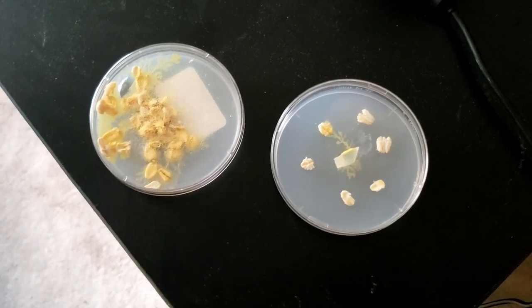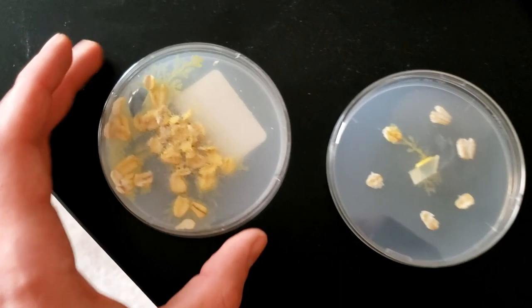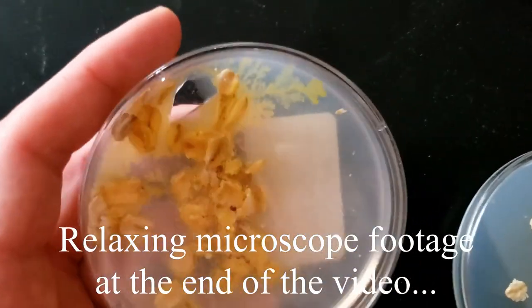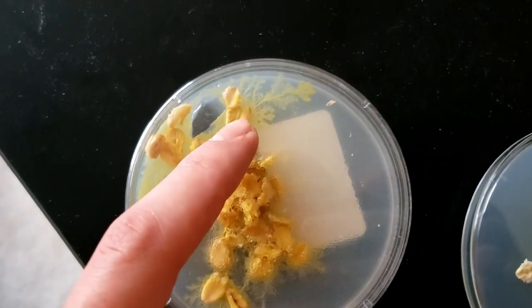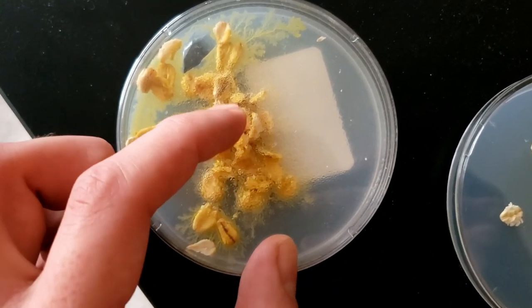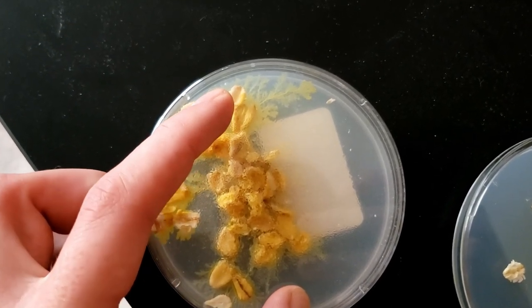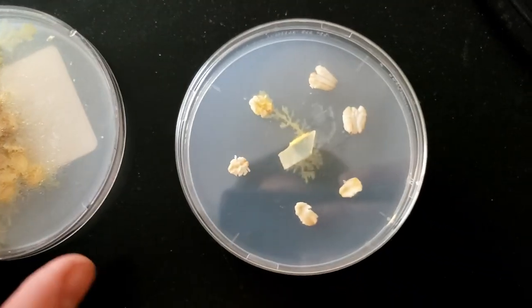So yeah, this thing is really fascinating. It's surprised me a bunch. So this was the original petri dish that the slime mold came on, and yesterday I was noticing it getting closer to the edge of the container. So it was coming from the center here. There's a little bit of condensation on the top of this plate, but it was in the center here and it was slowly making its way to the edge. It was like here, and I was worried it was gonna escape, so I decided it was time to replate it. So I replated it.